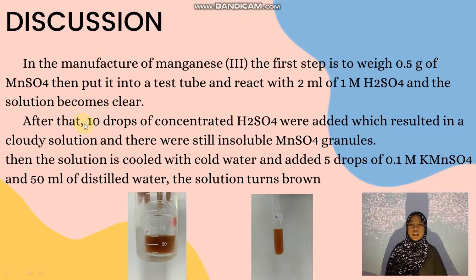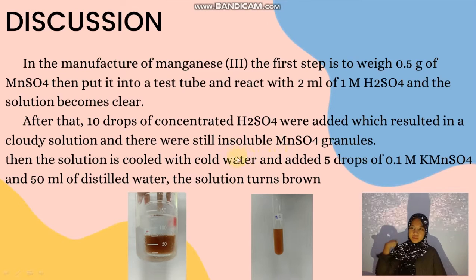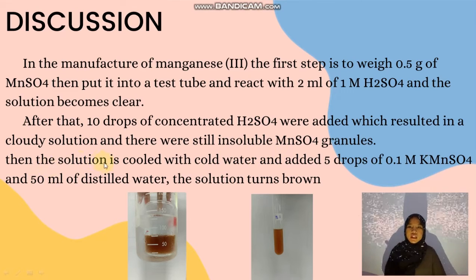After that, 10 drops of concentrated H2SO4 were added, which results in a cloudy solution, and there were still insoluble MnSO4 granules. Then the solution is cooled with cold water and added 5 drops of 0.1 M KMnO4 and 50 ml of distilled water. The solution turns brown.